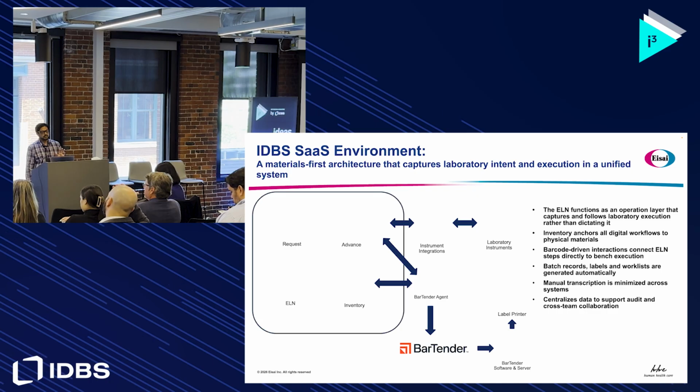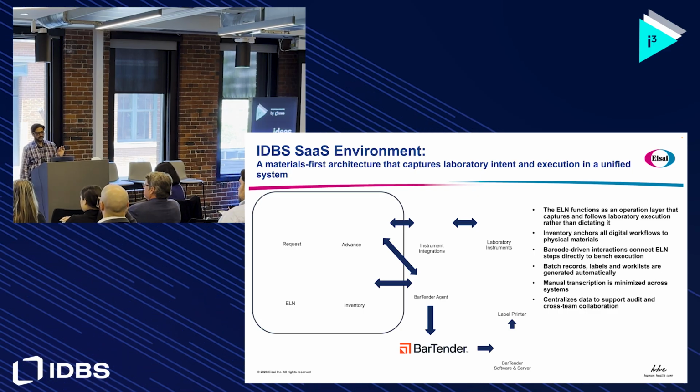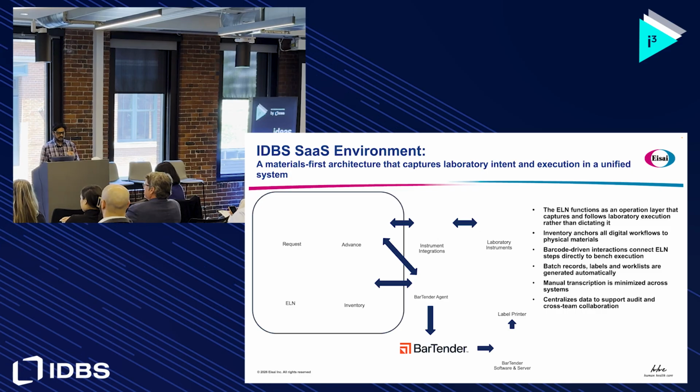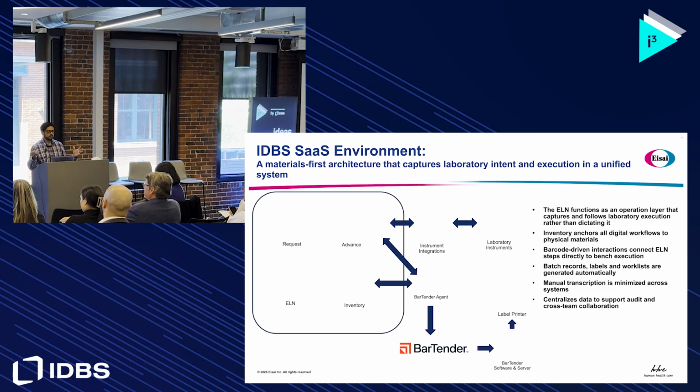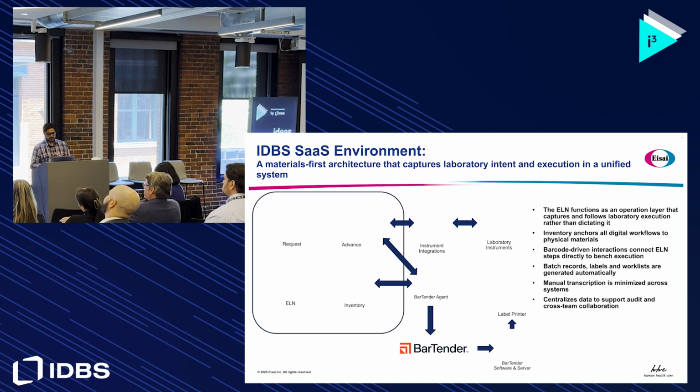Then we use Advanced as well. Advanced does interact with the barcode labeling process, but we use it to physically execute our tasks at the bench, and we also use it to integrate with some laboratory equipment.